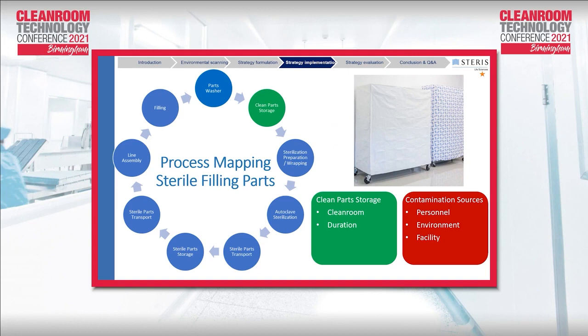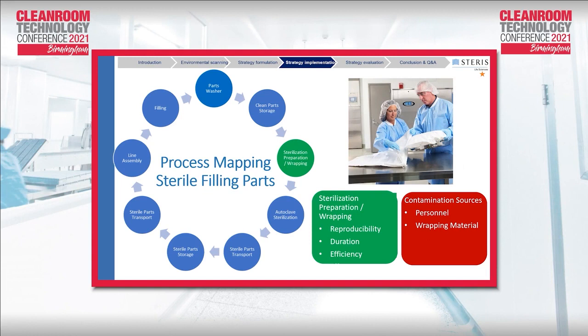Then the goal is, after that, to store the clean parts, and here really the potential source of contamination may come from your personnel, the environment, and the facility if it is not adequately protected from the clean rooms, or also taking into account the clean hold time, if you are respecting the clean hold time before it gets to the preparation for wrapping and then sterilization.